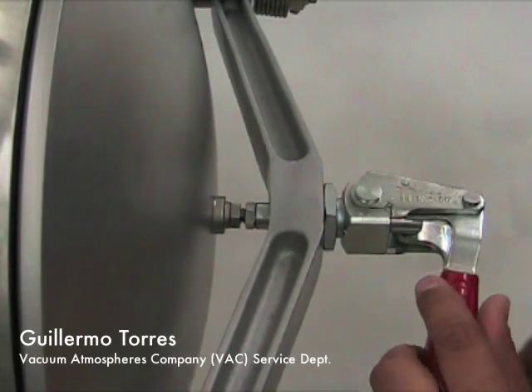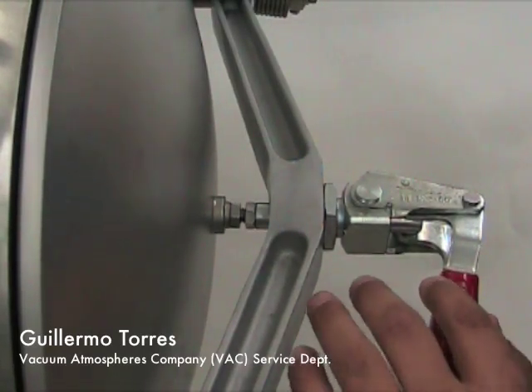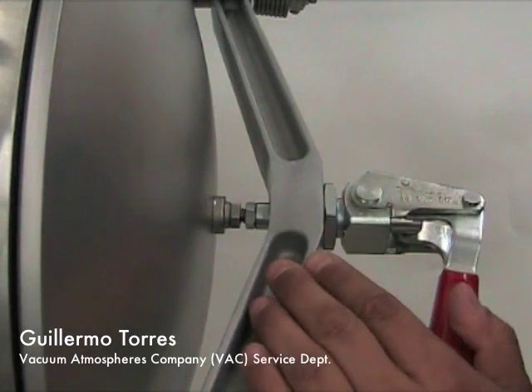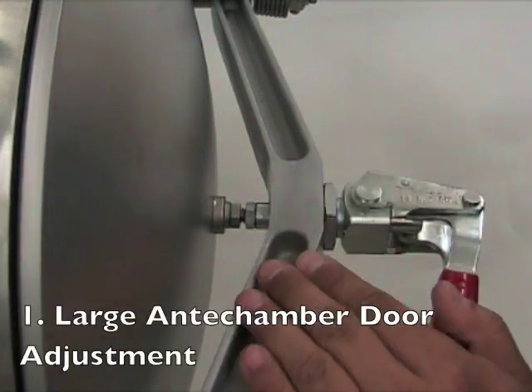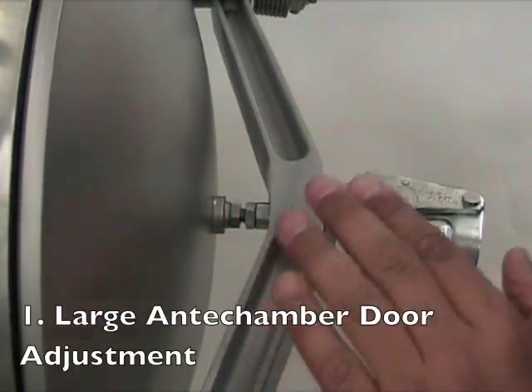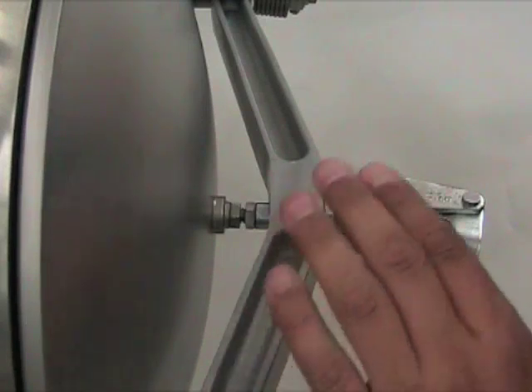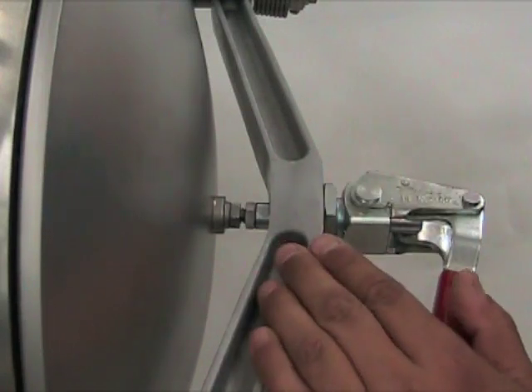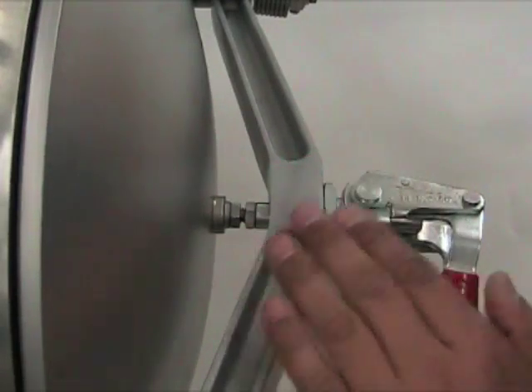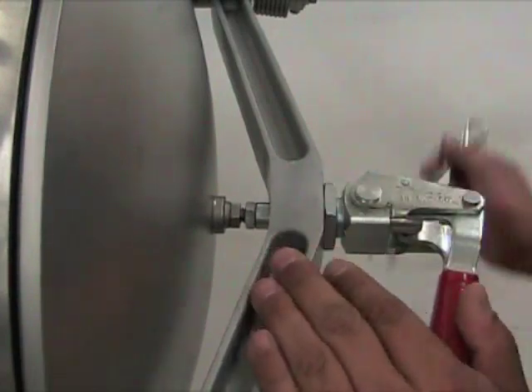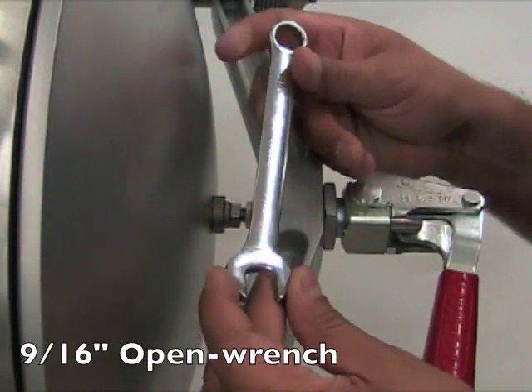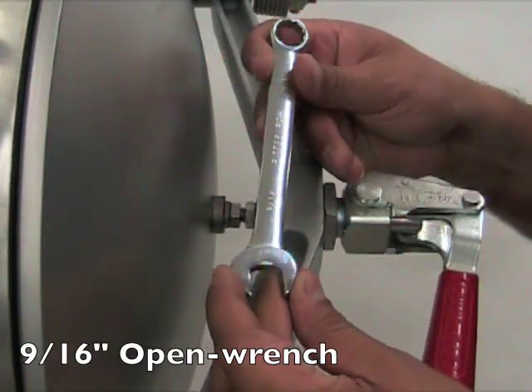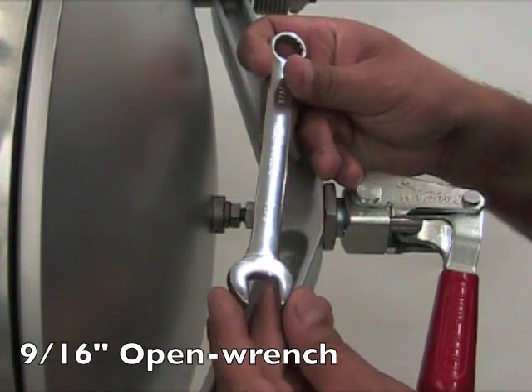In this video I'm going to demonstrate how to adjust the large and small anti-chamber doors for proper closing tension. I'm now going to demonstrate how to adjust the large anti-chamber door. This will require a 9-16 inch open wrench.